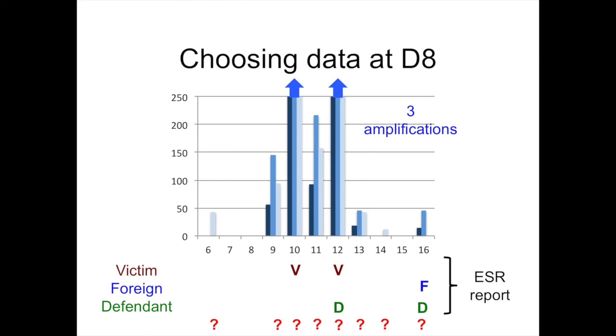But if you look at all the data and you start looking either at peaks that people could say, oh, that's just stutter, let's not use that. Oh, maybe that's stutter, let's not, oh, we don't use that. That's after stutter, oh, we're not forward stutter, we're not going to use that. That's too low. It's kind of like Casey at the Bat, right? You just keep watching the data fly by. Every one of these question marks is a potential allele, and any pair of those should be considered. But in a nice little table, it looks very incriminating because you're not looking at the original data and the choices that are being made.